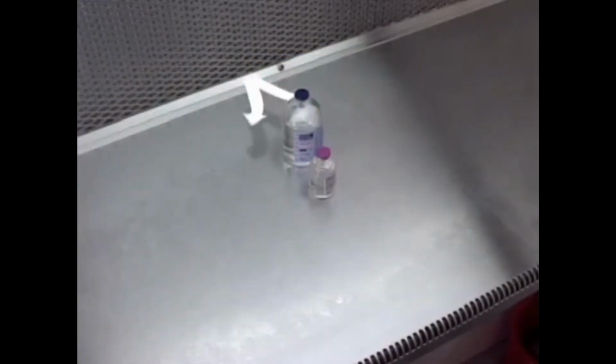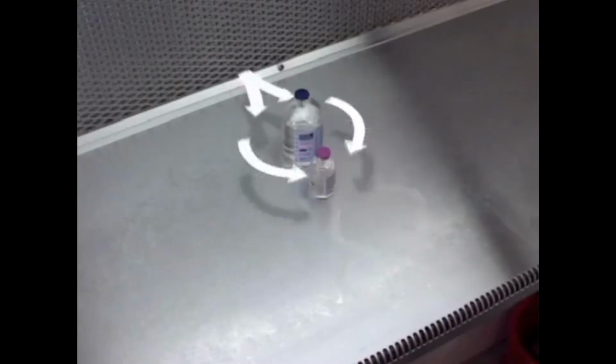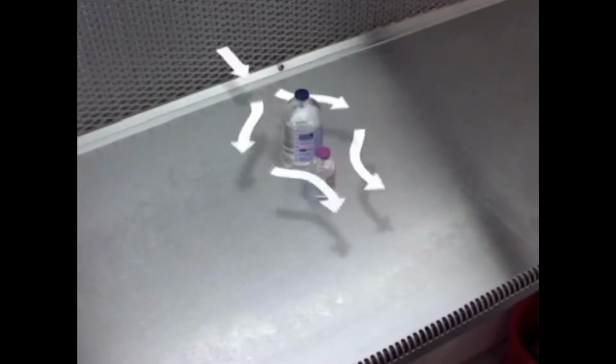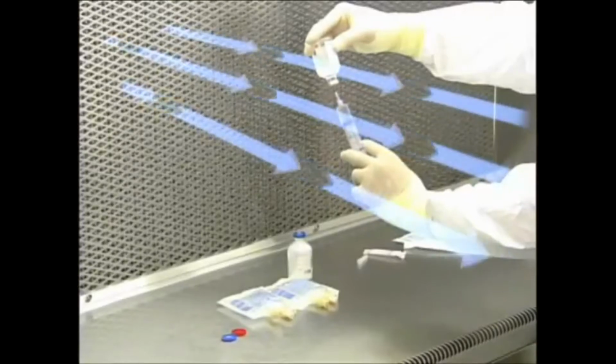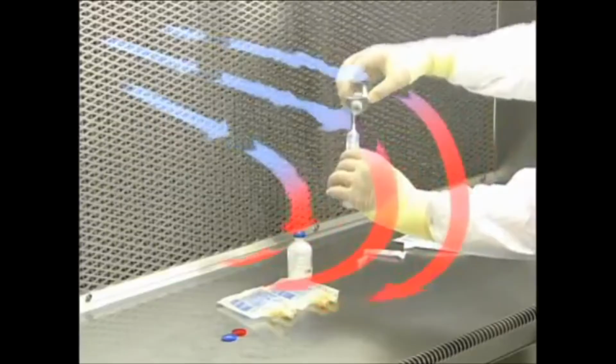ampule. The zone of turbulence refers to the air turbulence created inside the critical area by an object in the direct path of the first air. This zone of turbulence could potentially extend outside the hood, drawing contaminated room air into the aseptic working area. Remember, when laminar airflow is moving on all sides of an object, the zone of turbulence extends approximately 3 times the diameter of that object. And if laminar airflow is not accessible to an object on all sides, the zone of turbulence may extend 6 times the diameter of the object.